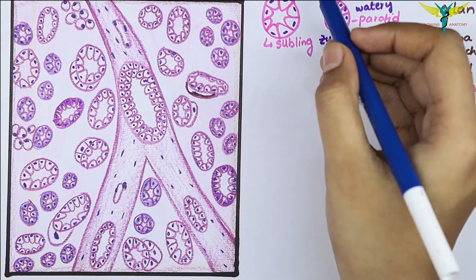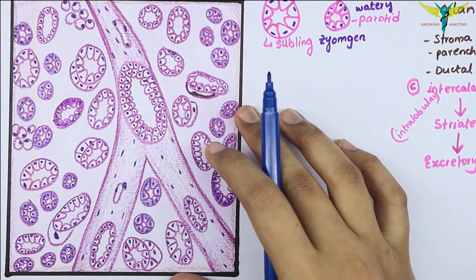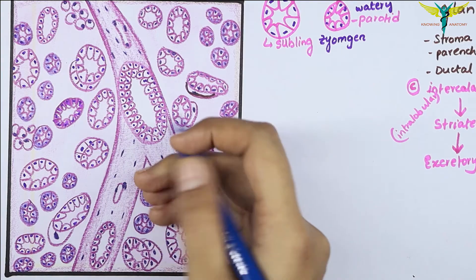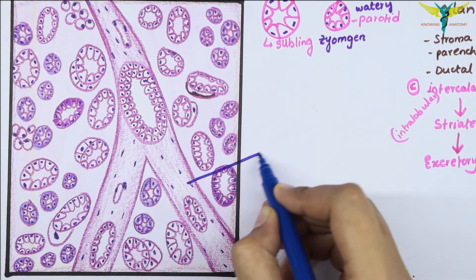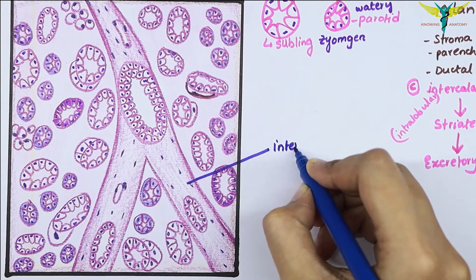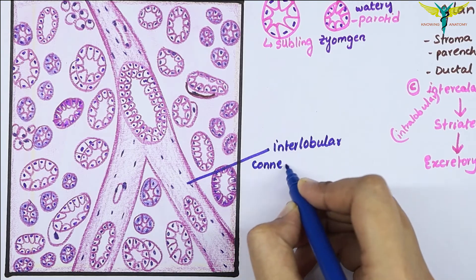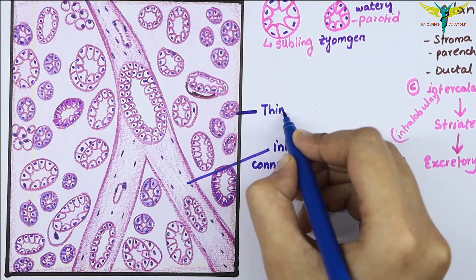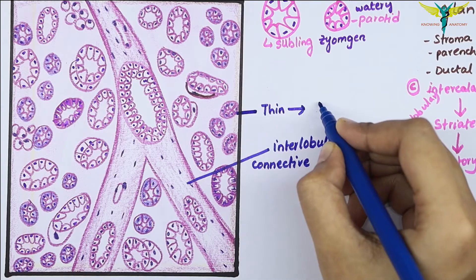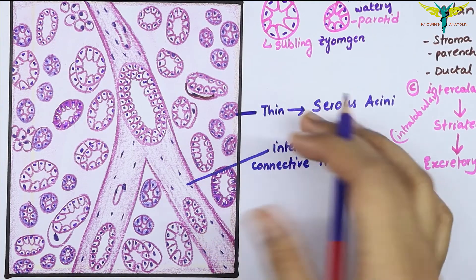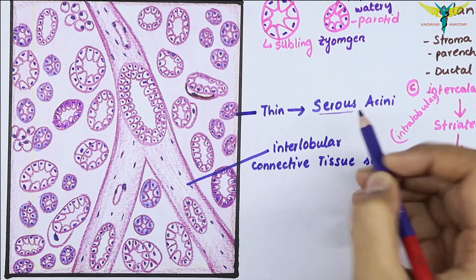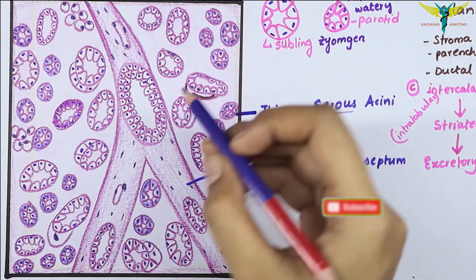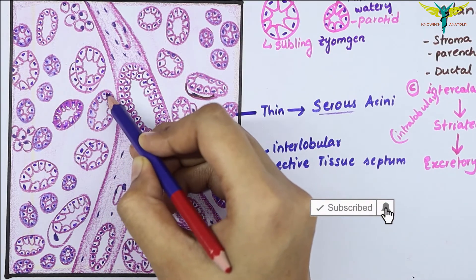The submandibular gland is the mixed type of salivary gland and contains predominantly serous acini with some mucous acini. This septa is the interlobular connective tissue septum. The serous acini, which are filled with thin watery material, are always stained dark in hematoxylin and eosin stain, with nuclei placed at the base and rounded in shape.